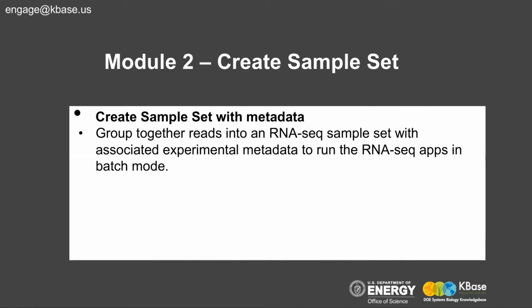Okay, so once you have imported reads, you can group together those reads into an RNA-seq sample set with associated experimental metadata so that you can run the RNA-seq apps in batch mode rather than running on individual reads. And this is a really good feature, then you don't need to worry about running each individual read.